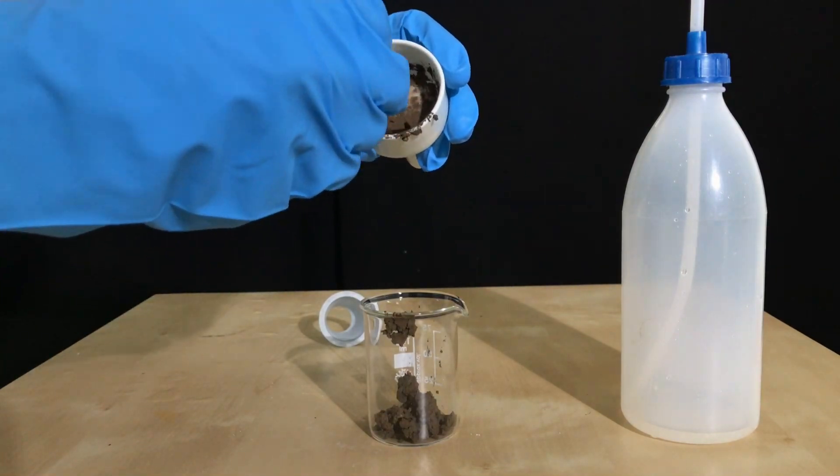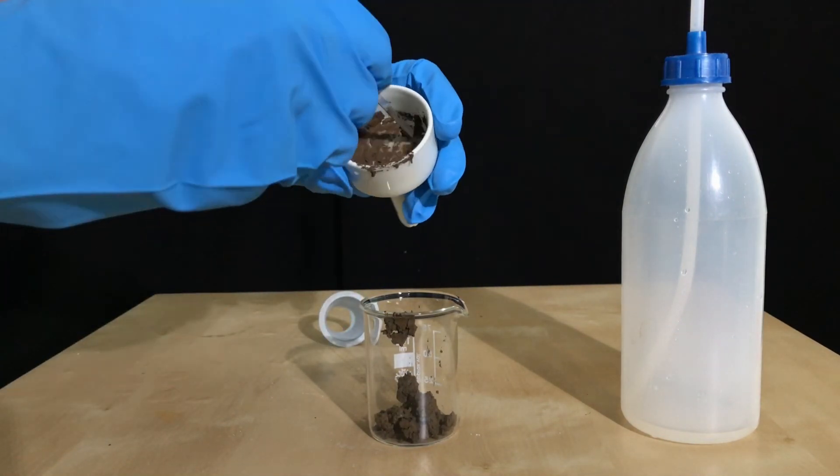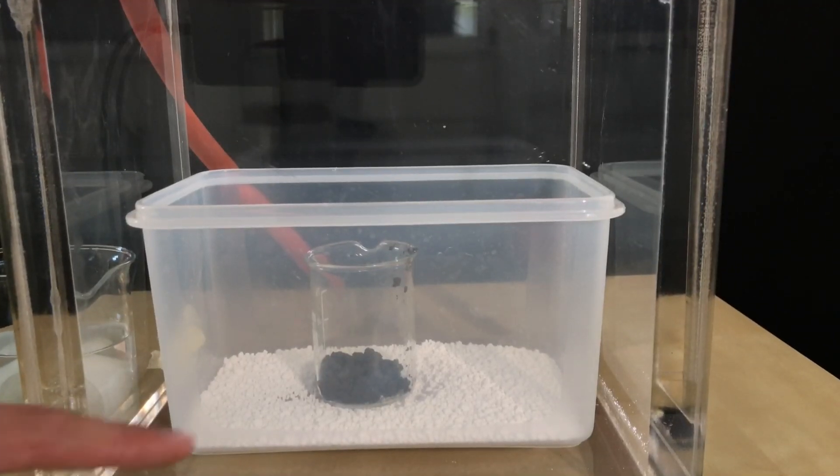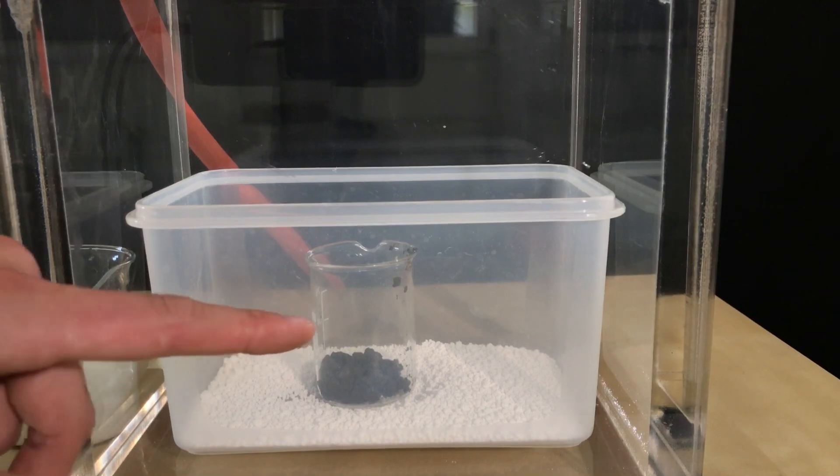As silver oxide will decompose at about 130 degrees Celsius, it is not recommended to dry it on a hot plate, because it would simply decompose to form oxygen and silver. Other ways to dry it have to be employed.